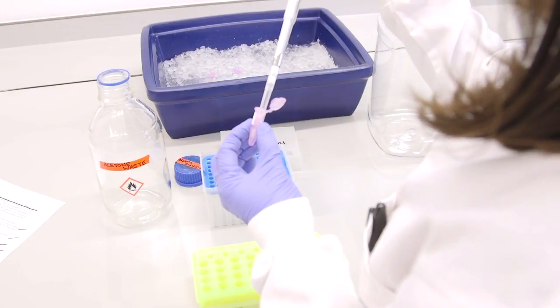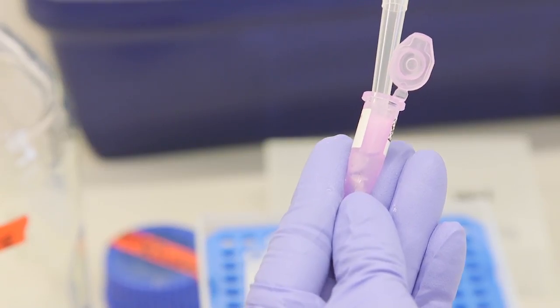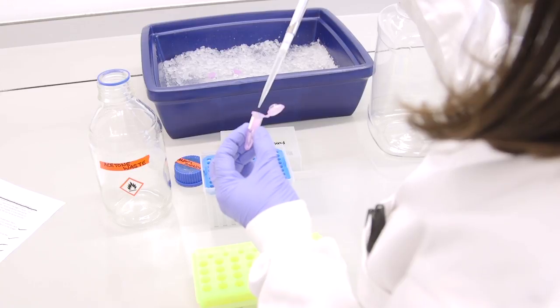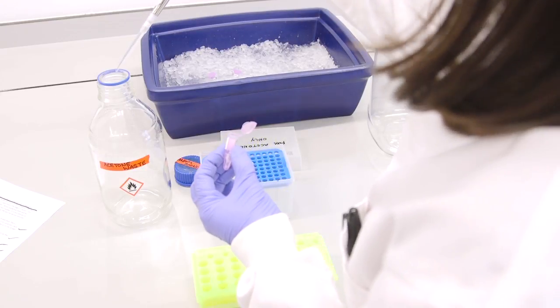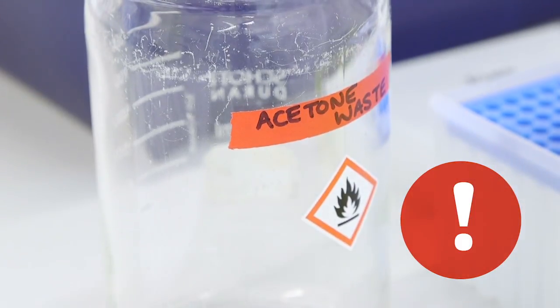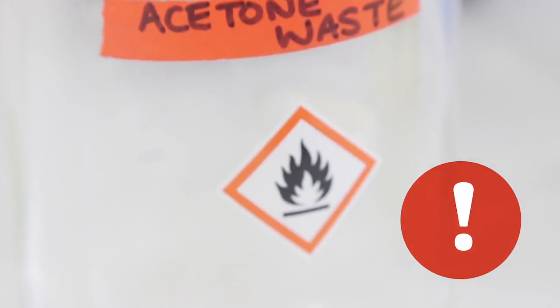Once the 20 minutes are up and whilst wearing safety glasses, remove the acetone from each tube using a filter tip. This should be placed into a designated waste container. Acetone waste should be kept in a flammables cabinet and disposed of according to local guidelines.